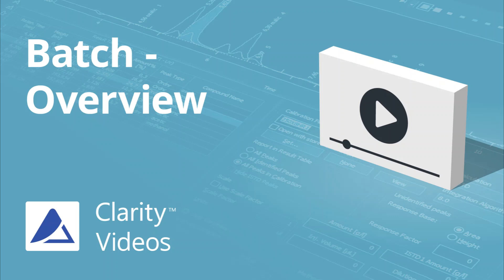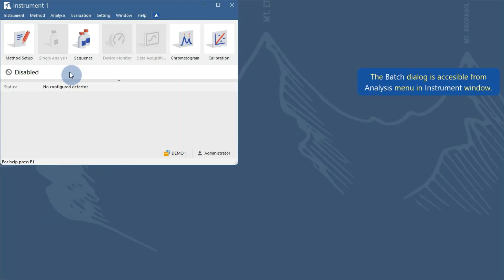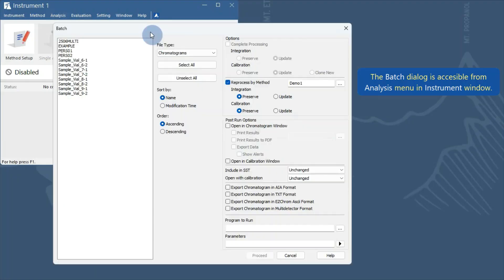Hello, in this video, I'll give you a quick overview of the Clarity Batch Dialog. The Batch Dialog is accessible from the Analysis menu and Instrument window.